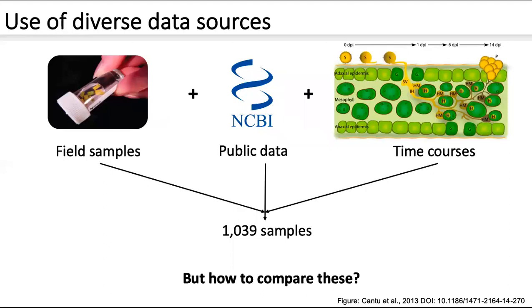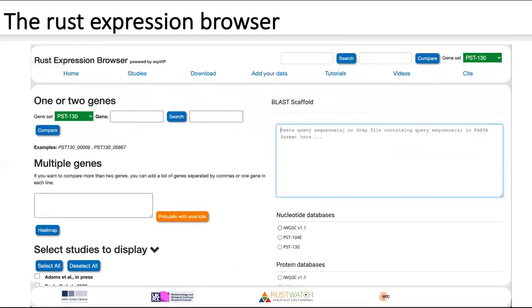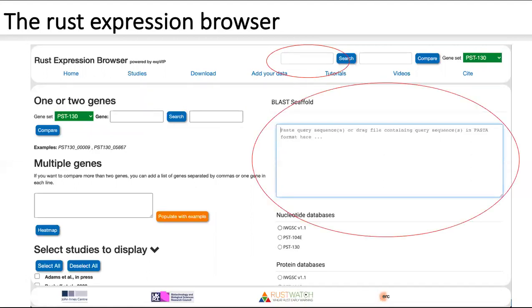So how do we solve this? How do we make this easier? We've developed the Rust Expression Browser, and here is the landing page. You can enter a gene ID into this box to search for a gene of interest, and add another gene to compare between the two. Under the multiple genes heading, you can add a number of different genes and produce a heat map of expression. Additionally, you don't need to know the gene ID — if you just have the nucleotide or protein sequence, we have a BLAST interface set up running by Sequence Server, a very user-friendly graphical interface, and it will link you straight to the expression results for that gene.